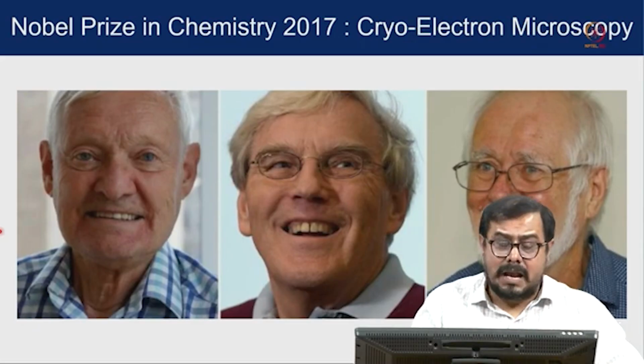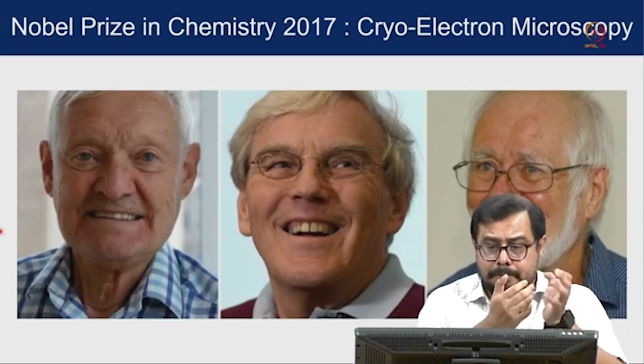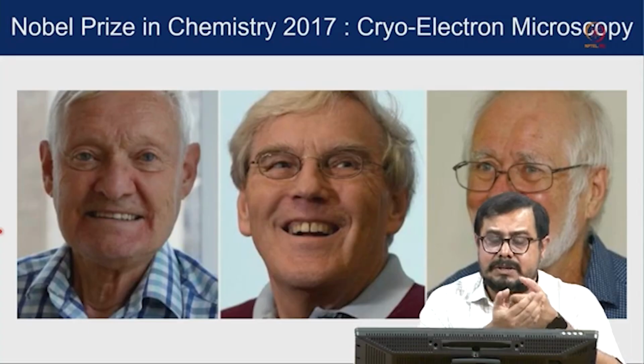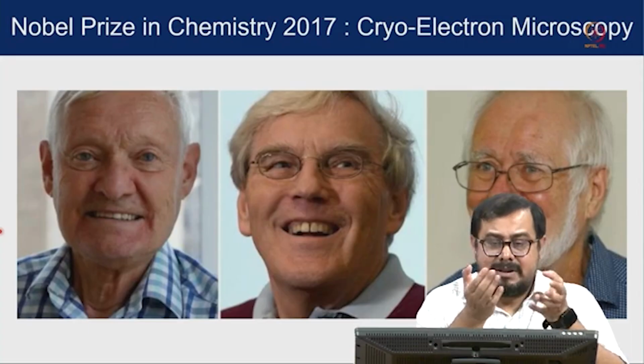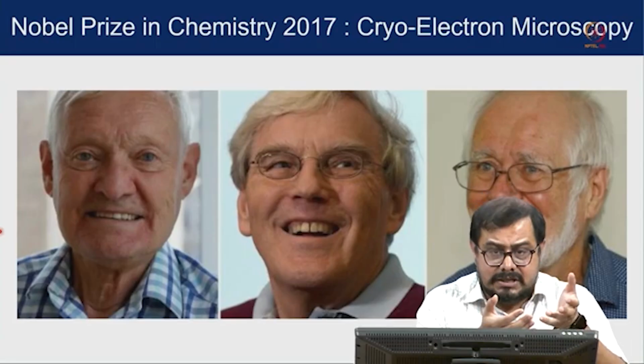So what is this cryo-electron microscope? Cryo-electron microscope is a modified version of the transmission electron microscope, where we use a similar kind of transmission electron microscope at a cryogenic condition.